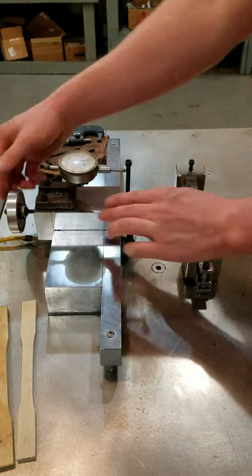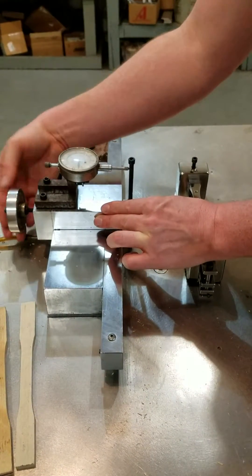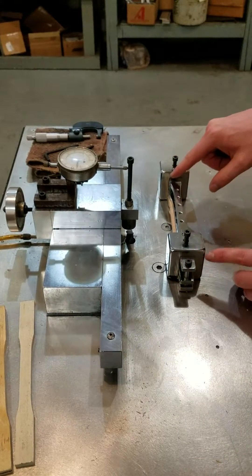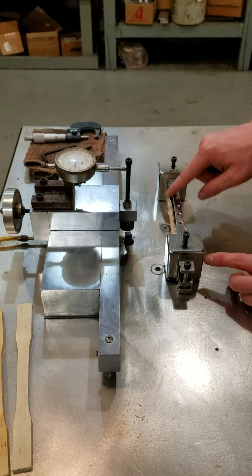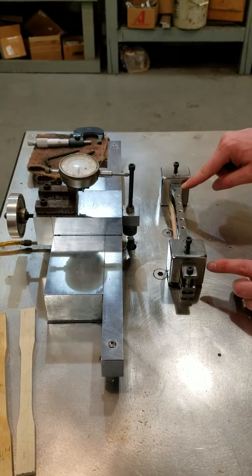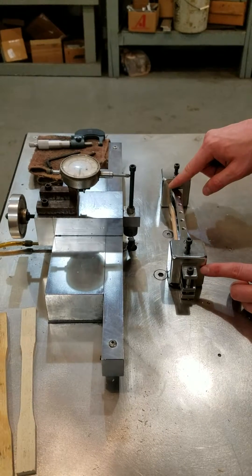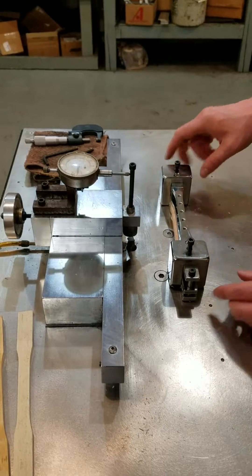I'm resetting my machine from our previous one. When we go out, we're going to make a 50 thousandths pass on one side, then 50 thousandths on the other, then another 50 thousandths pass, a third 50 thousandths pass, and then we're going to make 10 thousandths passes to finish it off — 10 thousandths, 10 thousandths, 10 thousandths — and the last one will actually be closer to 5 thousandths.